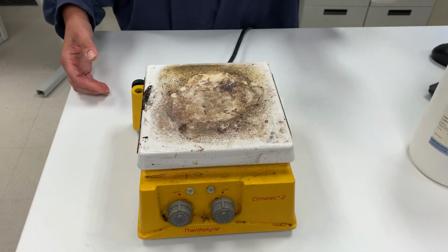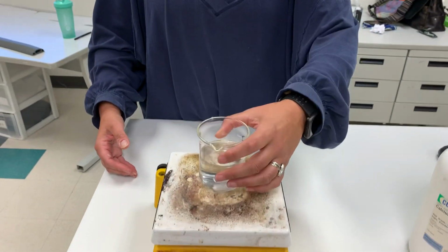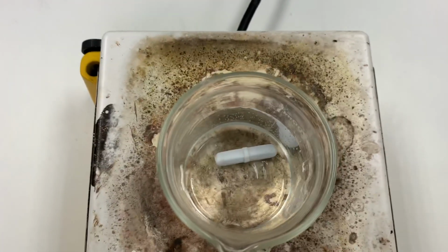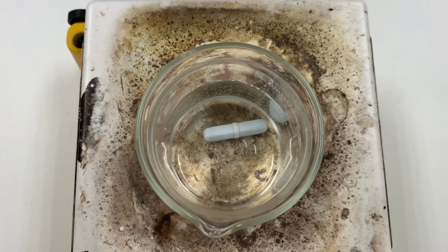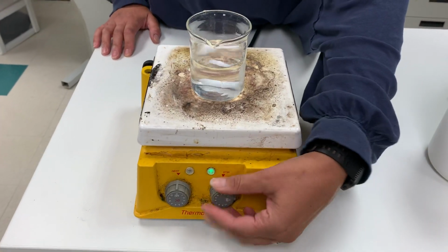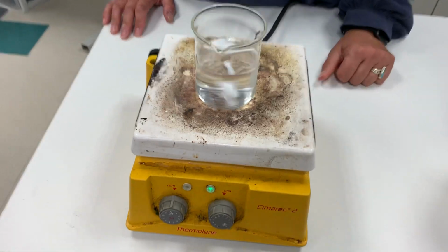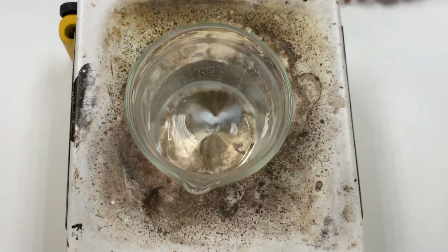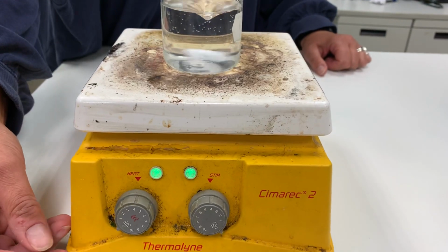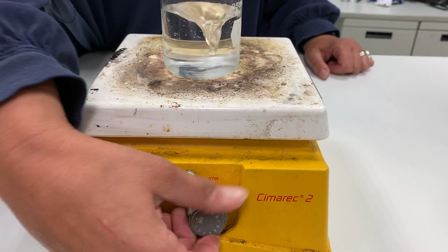Go ahead and get your holding container device, and in this case, if you look down on it, you're going to go ahead and see a magnet, and it's a stirring rod magnet, so that if you wanted to stir your device or your substance, you could just stir it. Or you could stir and heat it. Or you could just heat it.